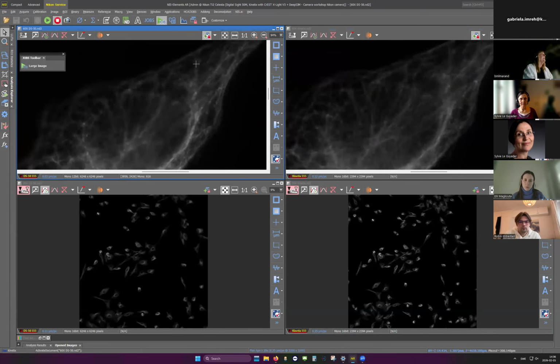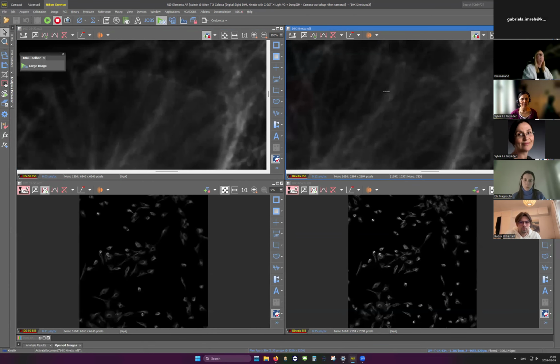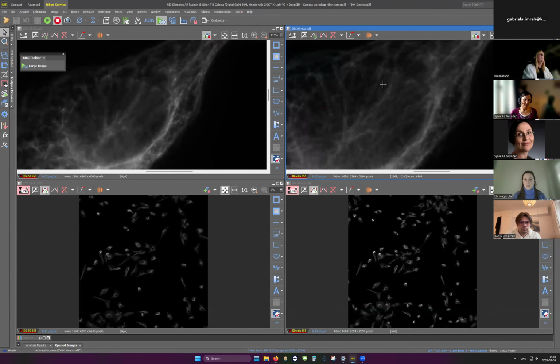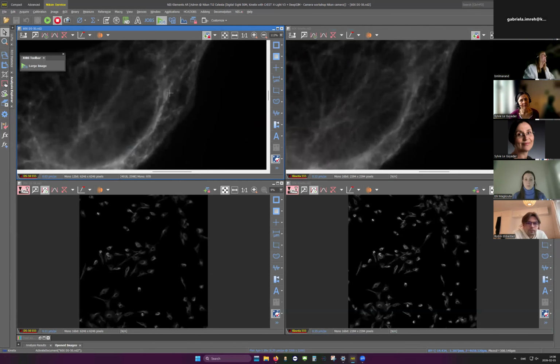The DS50 has smaller pixels and the Kinetics has pixel size that is better matched. And now we're talking about the optical resolution, not the digital resolution. So this to the left should be a little bit more oversampled, because you need to cover the optical resolution with 2.3 times the pixel size.